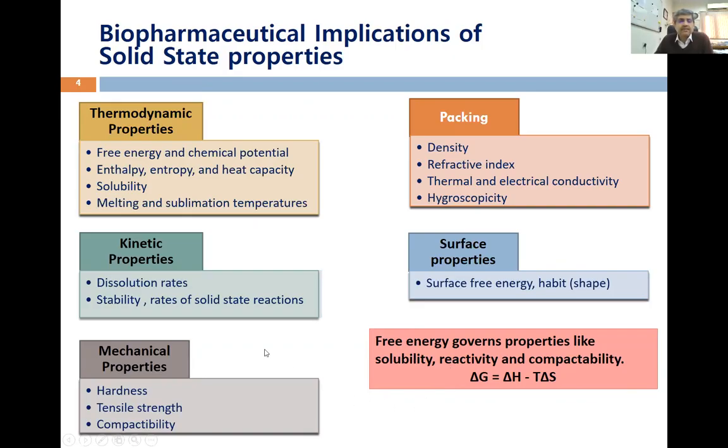As is evident from this slide, the solid state properties can impact a whole lot of properties that are relevant for the pharmaceuticals. That is why it becomes very, very important to characterize the solid state properties using appropriate techniques.